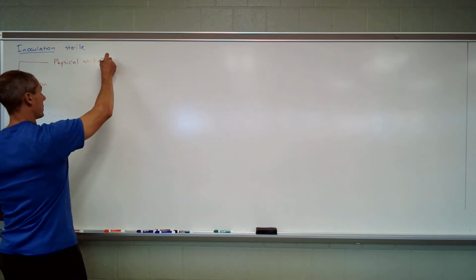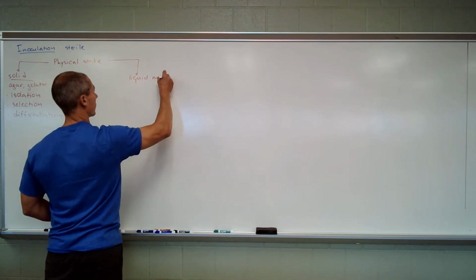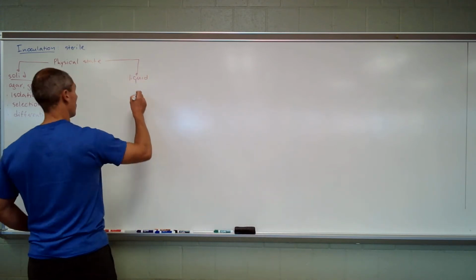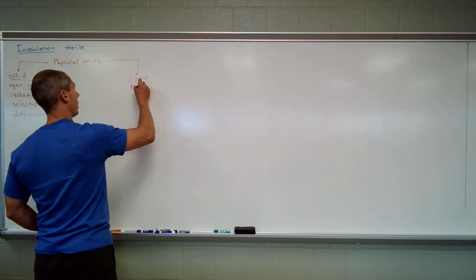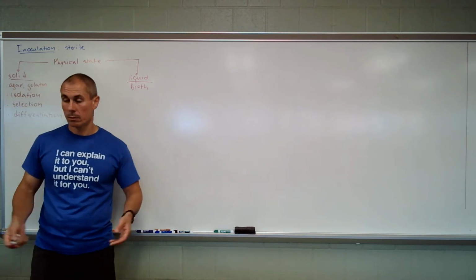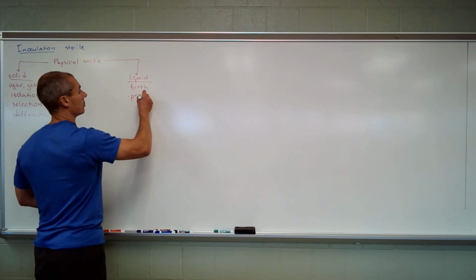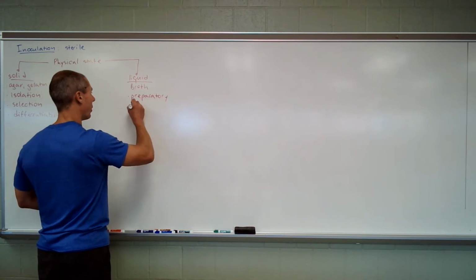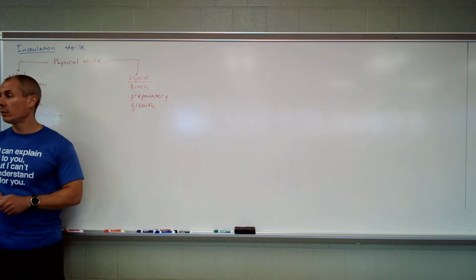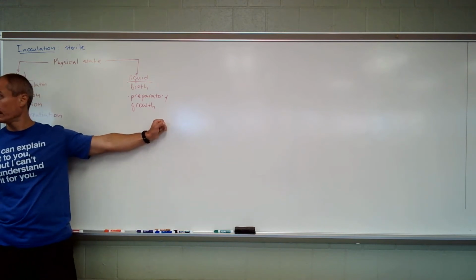On another end of the spectrum here are liquid media. So liquid media, well, obviously liquid, okay? Sometimes they're called broth. Chicken broth is medium. They're really good for, let's call it preparatory growth. What do I mean by that? If you need to accumulate, I don't know, 5 pounds of microbes, that's the way to go. You see what I'm saying?